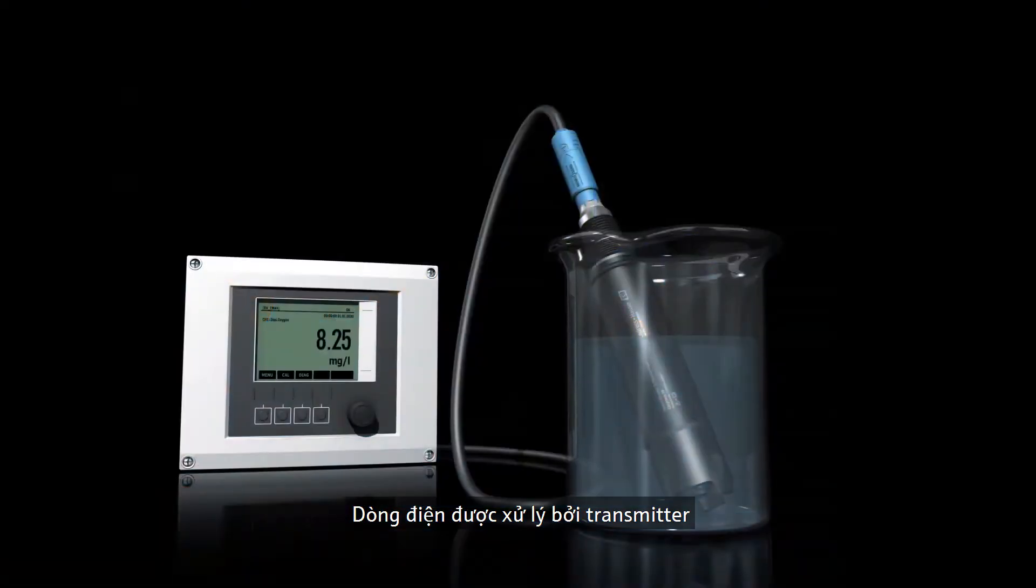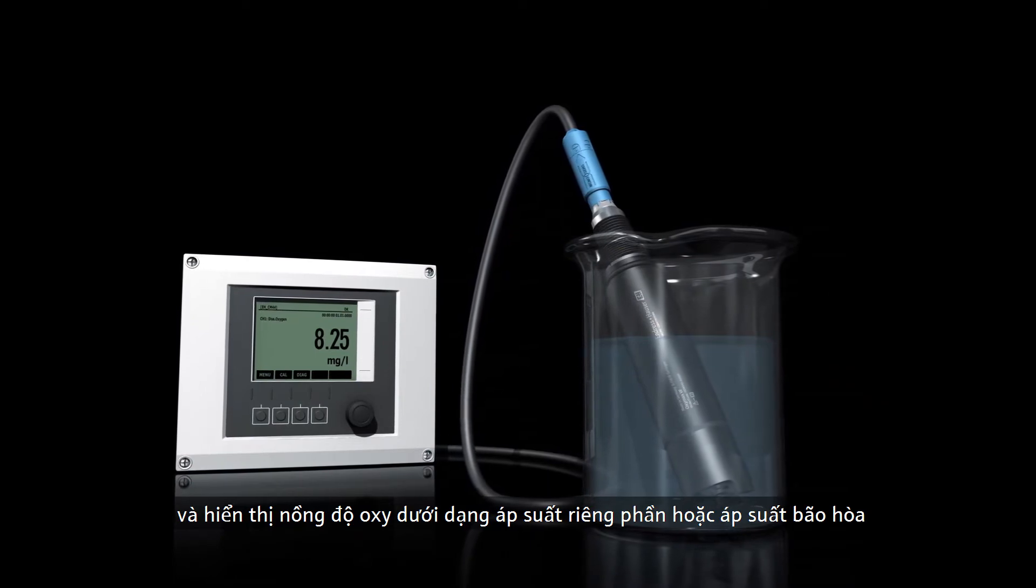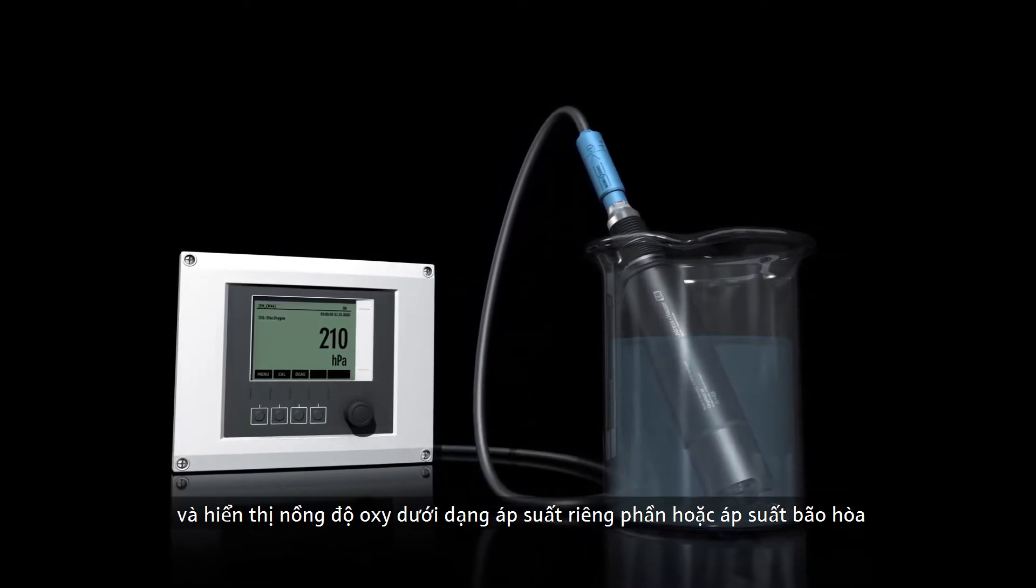The current is processed by the transmitter and displayed as oxygen concentration, partial pressure, or percentage saturation.